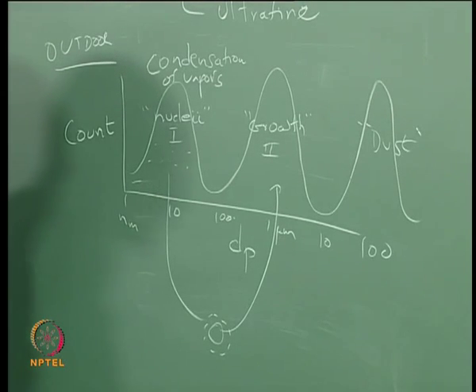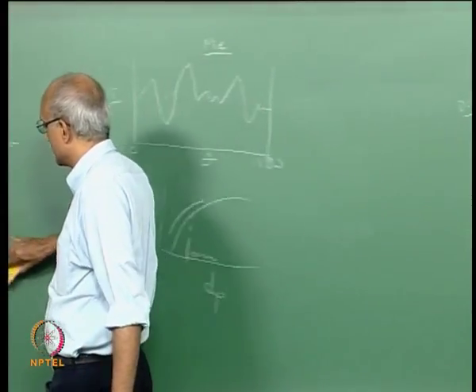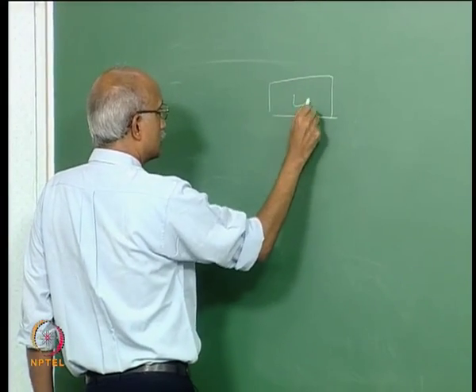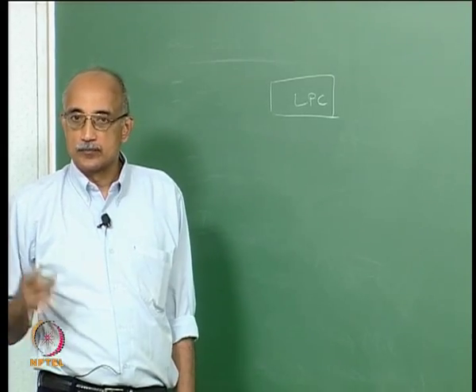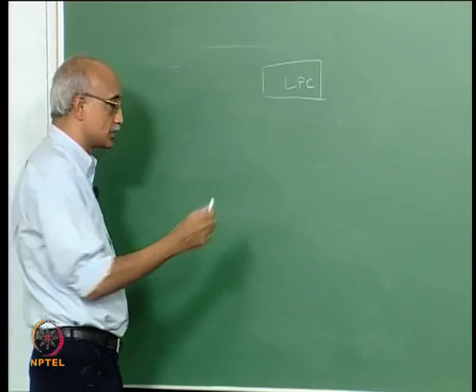And so that is how basically these condensation nuclei counters or condensation particle counters work. So a condensation particle counter is very, very similar to the laser particle counters that we have been discussing so far. It includes that as one of the stages in the process, but it adds a couple of stages to it.